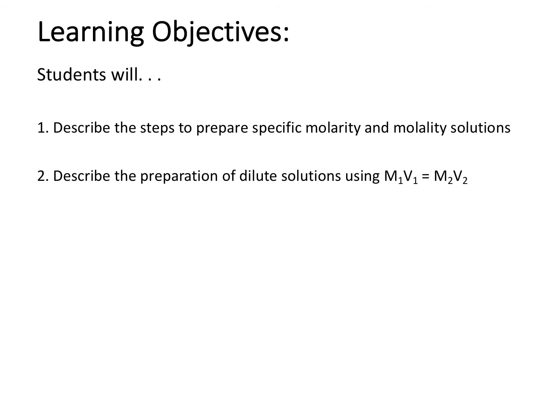After watching this video lecture, students will be able to describe the steps to prepare solutions, as well as prepare dilute solutions and explain the subsequent calculations connected.